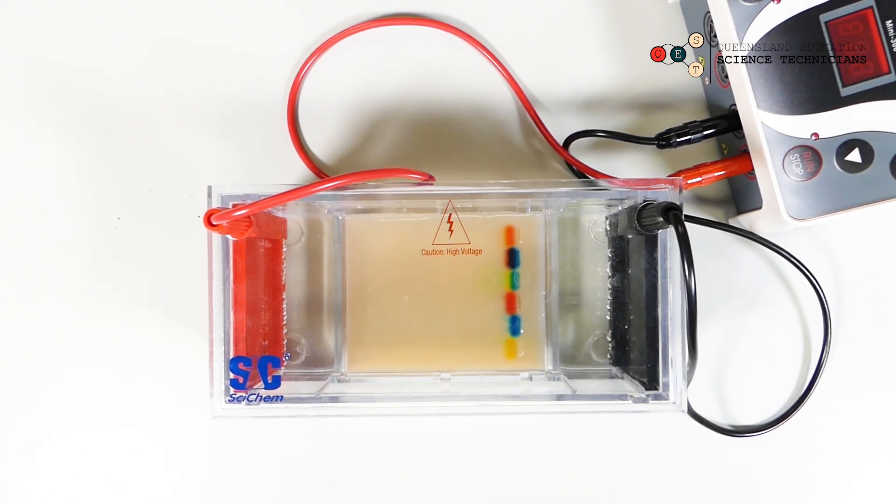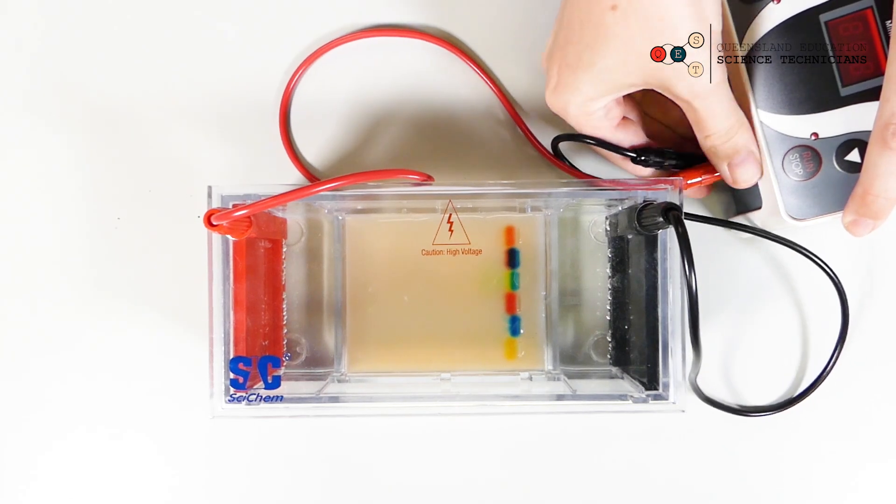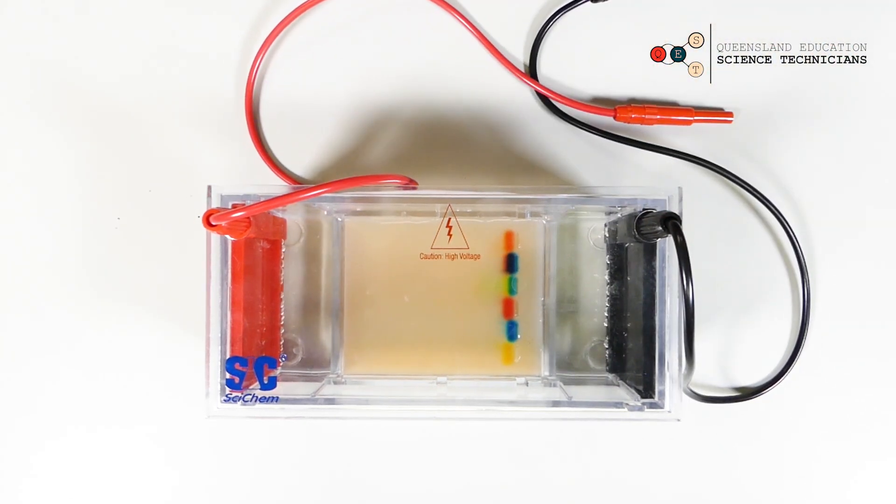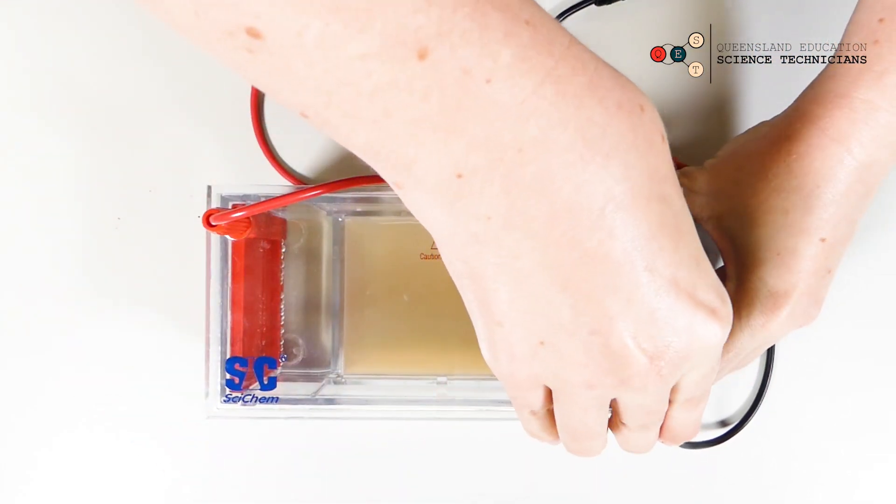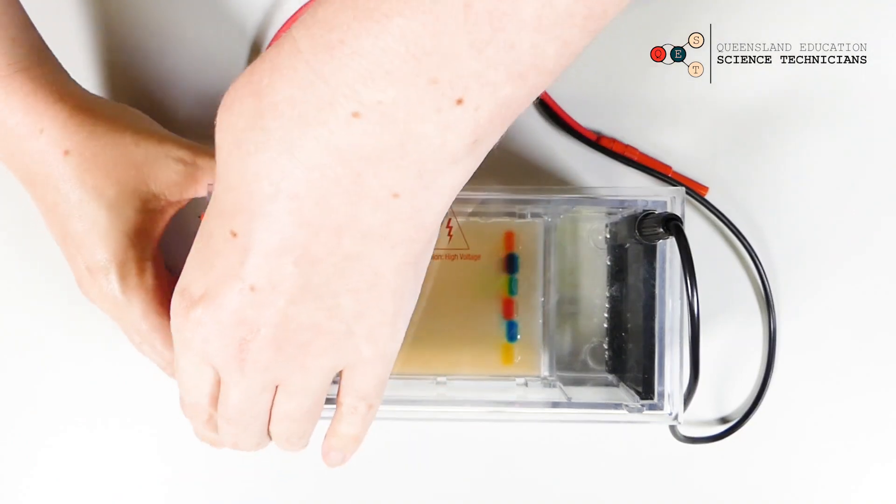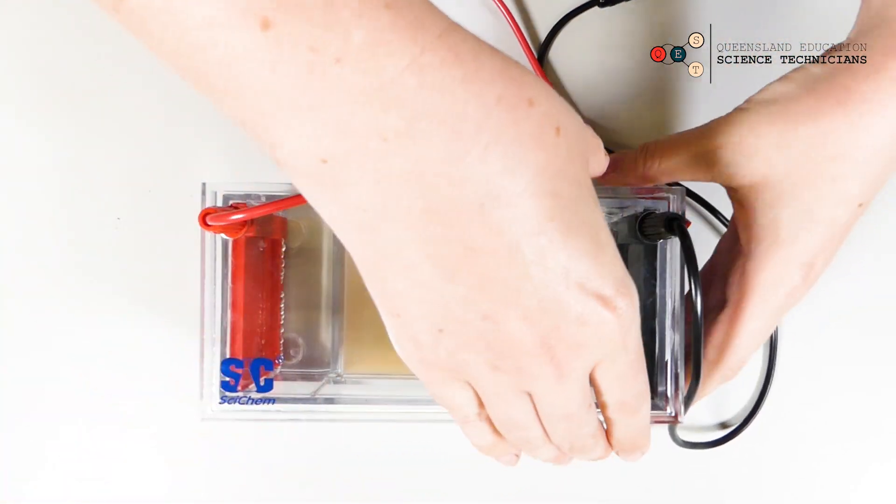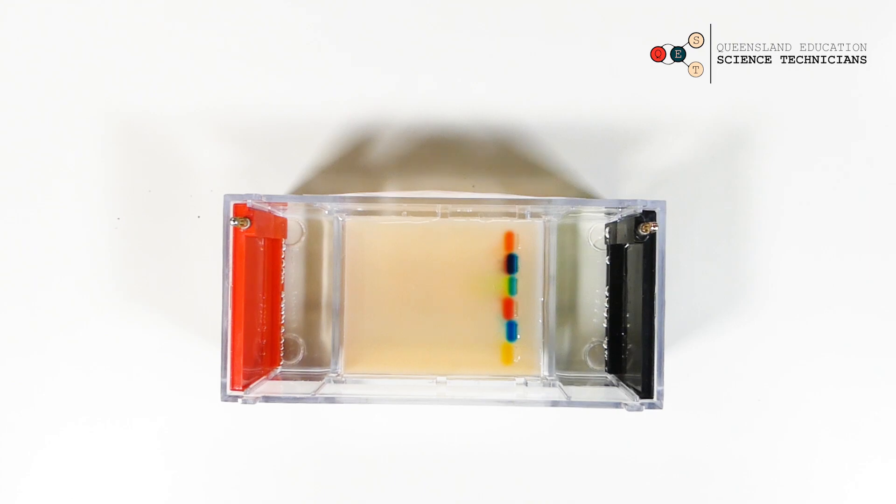Disconnect it from the power pack. Let's take our lid off and have a look at our gel. You can see that the colors have started to move from the cathode to the anode through the gel, and that the different colors have started to separate from each other.